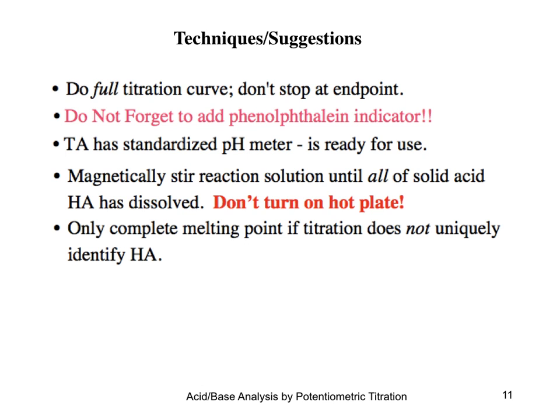If you can not uniquely determine your unknown from the molar mass and pKa, then you will need to do a melting point.